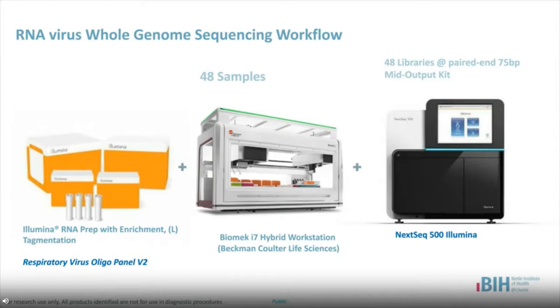While validating our clinical workflow, we simultaneously produced libraries for 48 samples on the Biomek i7 Hybrid Workstation that were then sequenced using a paired-end 75 base pair mid-output kit on the NextSeq 500 sequencer. Now I would like to give the floor to the automation specialist from Beckman Coulter, Randy Pearson, who will walk you through the process of implementing Illumina's protocol on the Biomek i7.